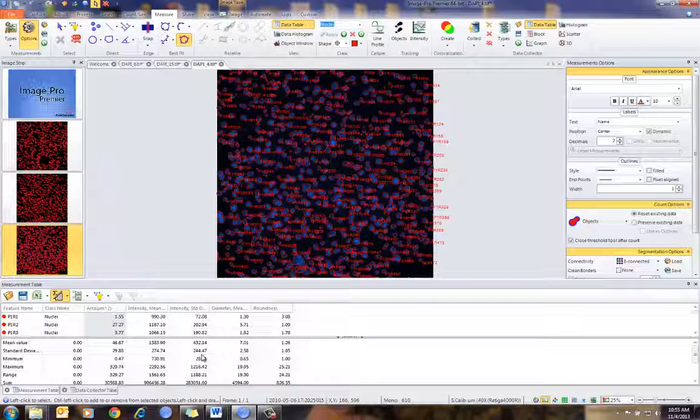As I mentioned, this can actually be tied into batch processing under the automated tab, where if I'm automatically counting a folder of images, say 100 images there, I can automatically set this up to accumulate the data in Data Collector and then report out that data in format that I've set up. I'm going to clear out this data for a second. I'm going to go into types.